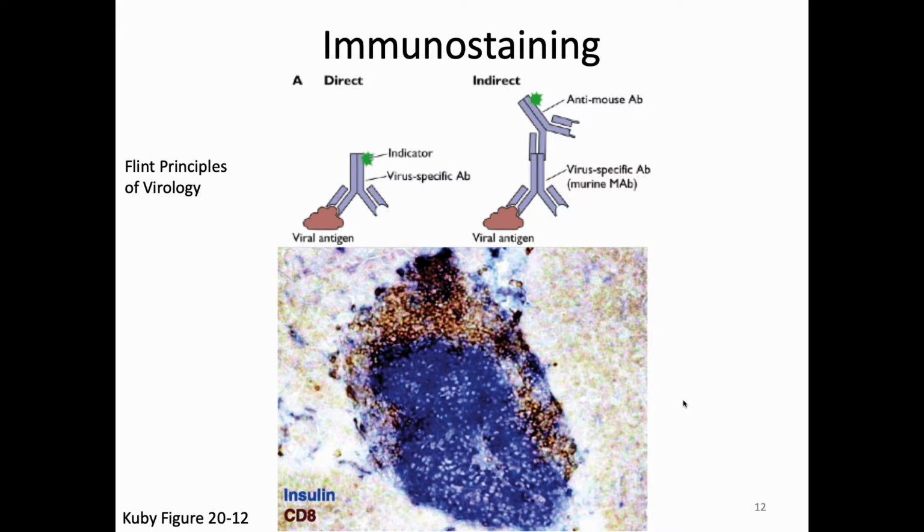And then what you might find out is, where in my cell is this antigen? Or if you're using tissue sections, you could find out, where in my tissue is this antigen? Is this antigen in this tissue? You could find out a lot of different things like that. You get a really nice sort of picture.